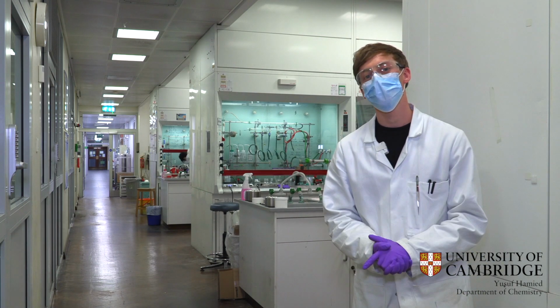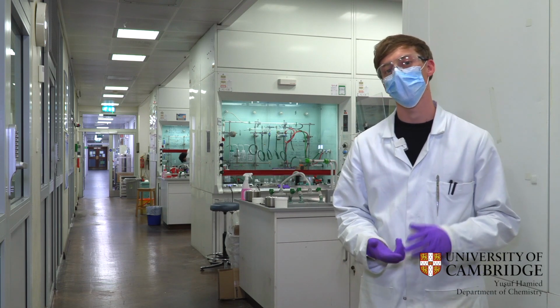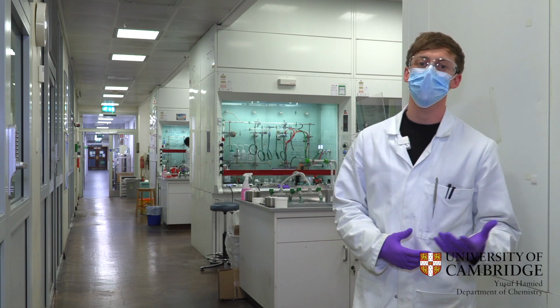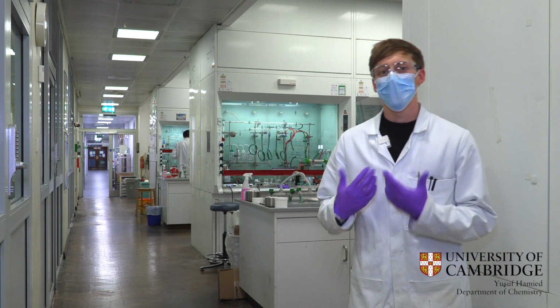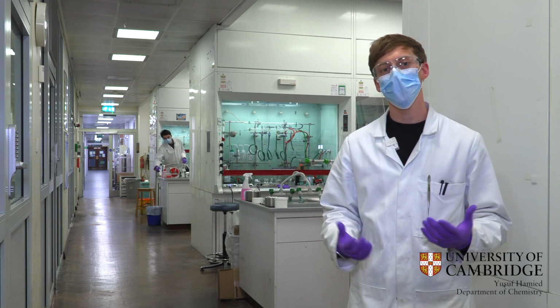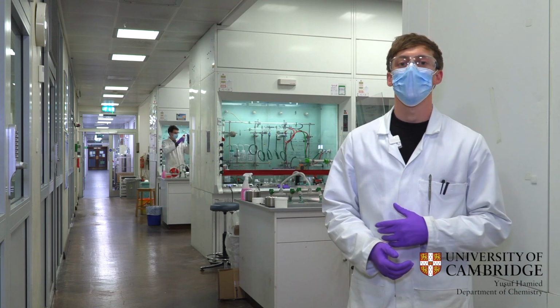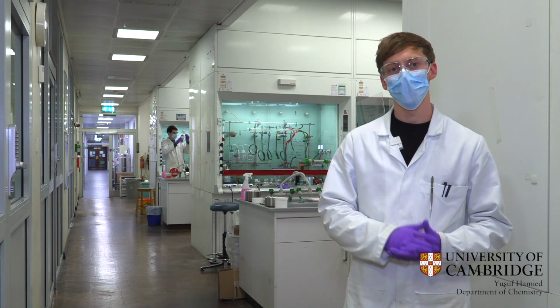So here in the Phipps lab we like to use non-covalent interactions, so things like hydrogen bonding and ion pairing, to try and address selectivity challenges when functionalizing molecules. Now these types of functionalizations we like to work on typically involve CH bonds, and with lots of them in a molecule we try and use ways to select one over another.